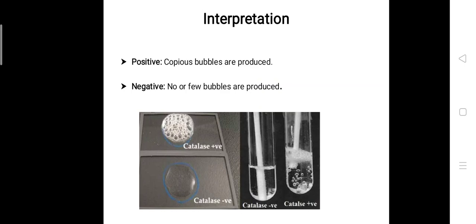One very important thing: whenever you do this catalase test, make sure that you do not pick up colonies from the blood agar plate, as this plate contains red blood cells. Blood agar is prepared with blood, so it contains red blood cells which themselves have catalase present in the plate. When you collect colonies from this plate, it can give you a false positive result.